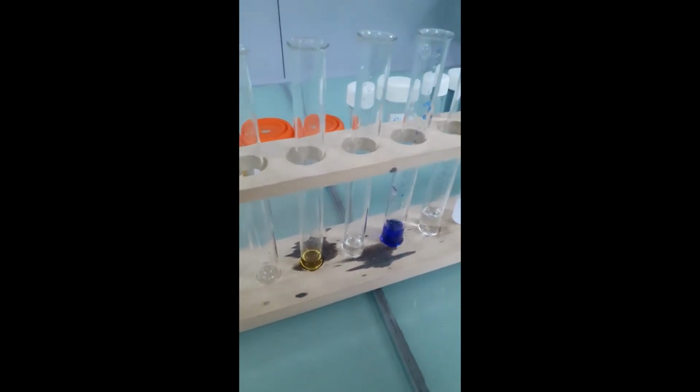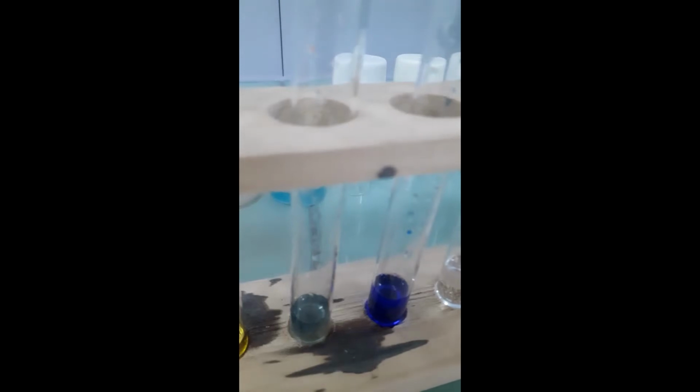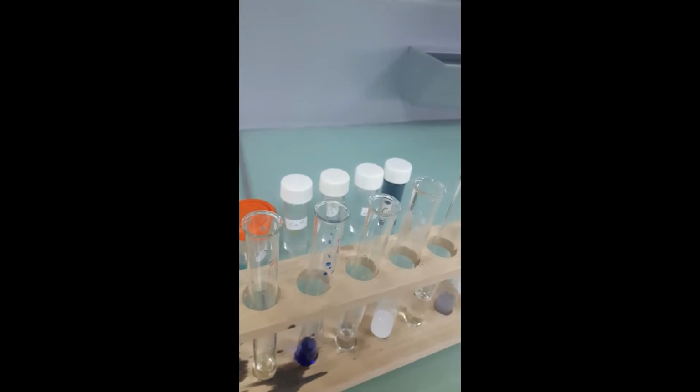In the next test tube, there is Fe2+, and I'll be adding a few drops of dilute ammonia. Now I'll add some more drops of the dilute ammonia.